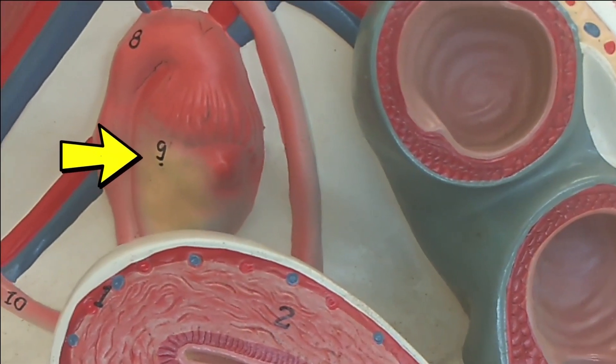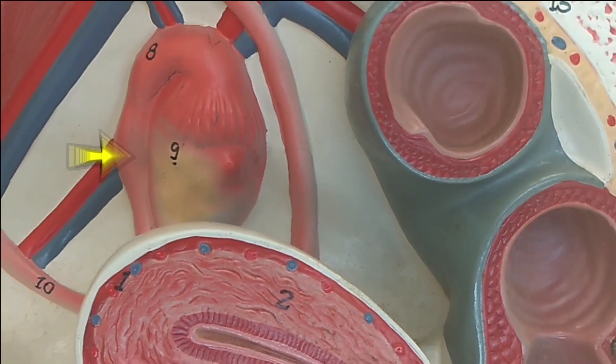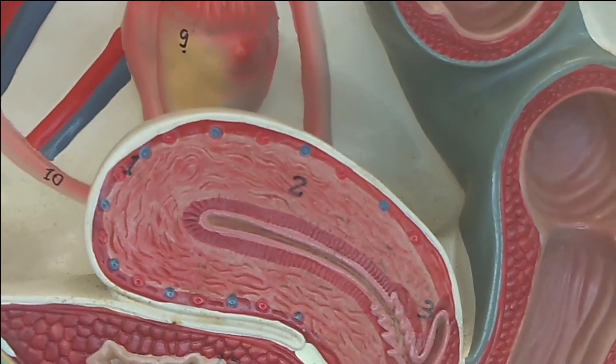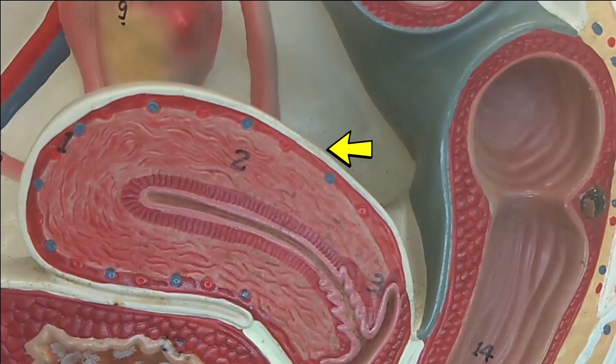You can see here, structure number 9 is the ovary and structure number 8 is the oviduct. Moving downward, you can see the uterus.